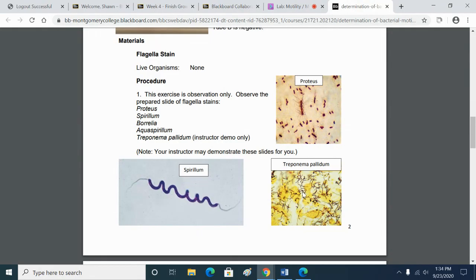Here we have Treponema pallidum. So this organism is a spirochete. What kind of flagella do spirochetes have? They're the ones with the axial filaments, the endoflagella. You cannot actually see them unless you have something like an electron microscope anyway. But remember, they do not stick out. They are attached to the cell on one end, and they run along the cell body. And they're actually in between the cell and an outer structure called a sheath. And that causes them to twist like a corkscrew.